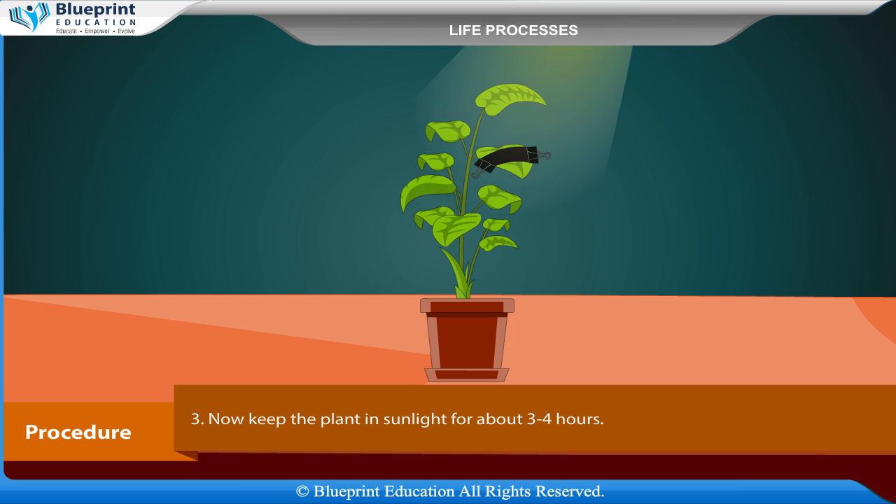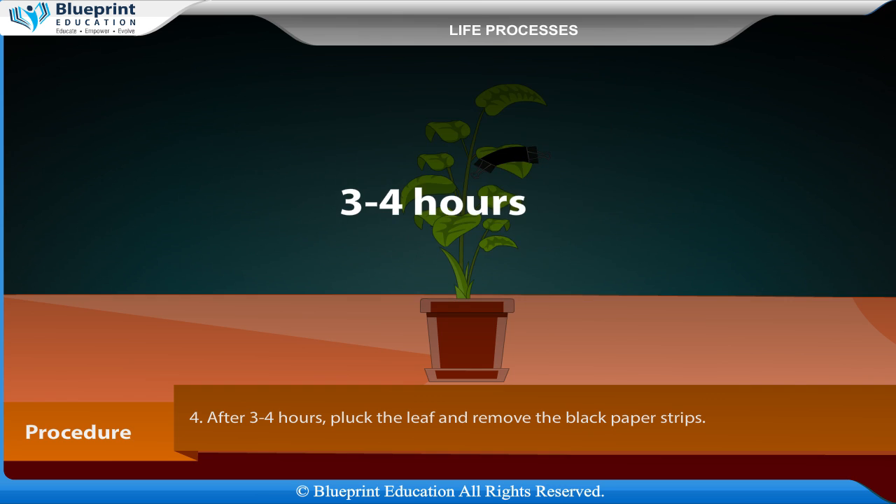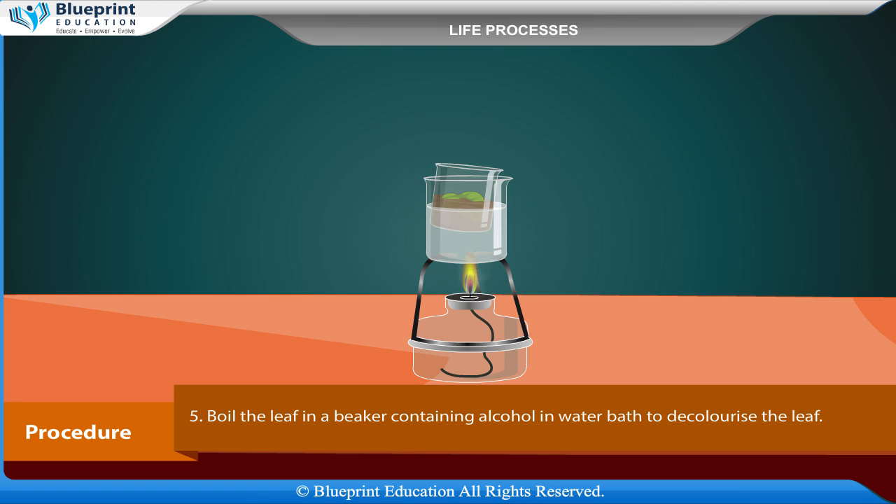Now keep the plant in sunlight for about 3–4 hours. After 3–4 hours, pluck the leaf and remove the black paper strips.